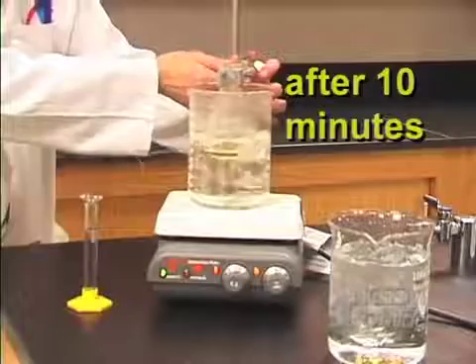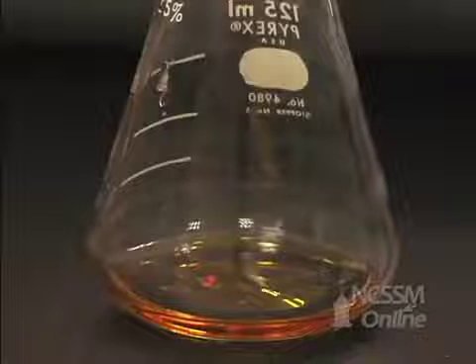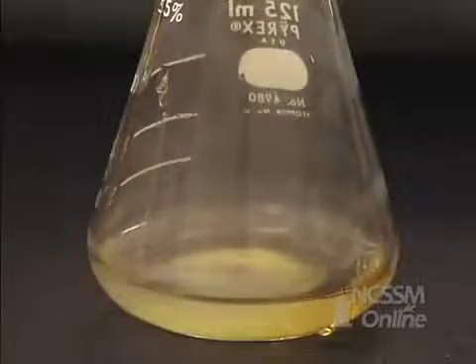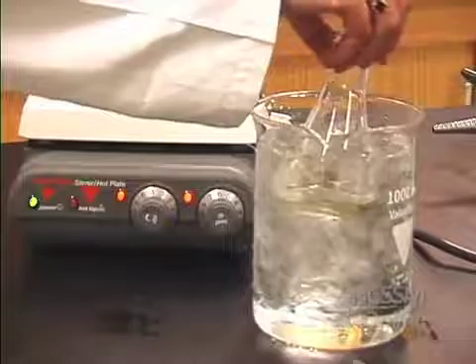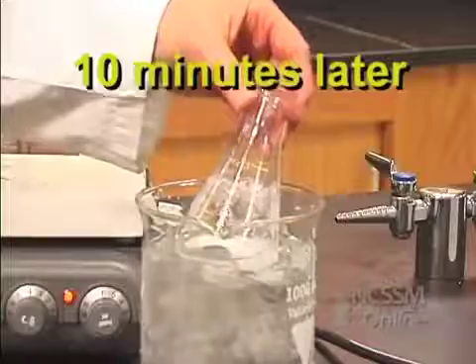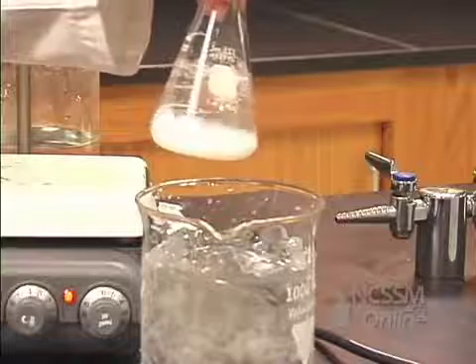After 10 minutes, you can see that the color has a sort of yellowish brown tint to it. Now we're going to add 10 milliliters of cold water. Now we're going to put this in a cold water bath and allow the aspirin crystals to form. So you can see we have lots of aspirin crystallized in our Erlenmeyer.